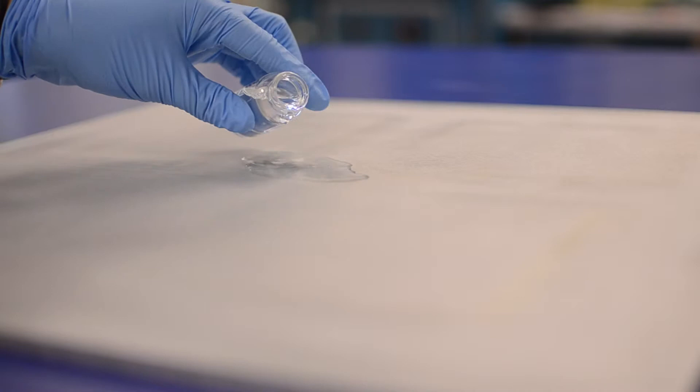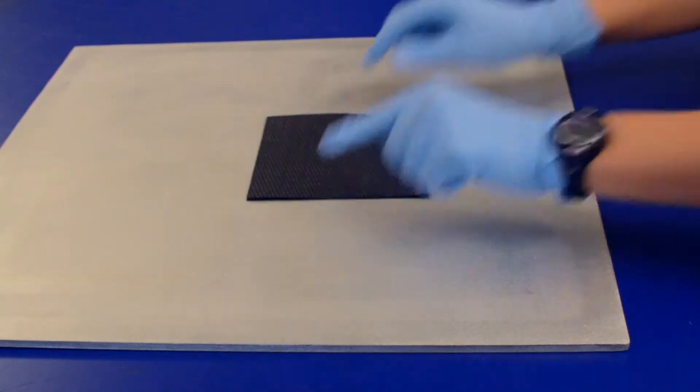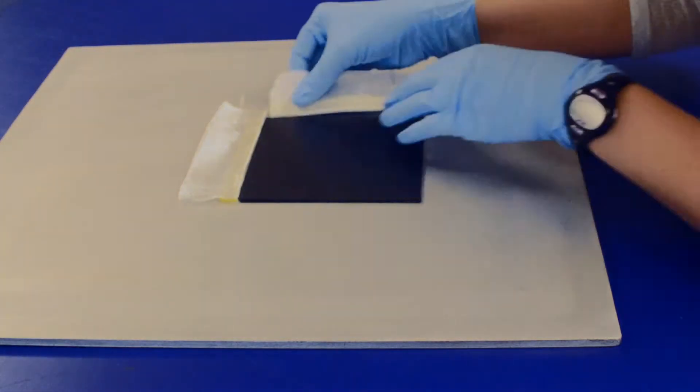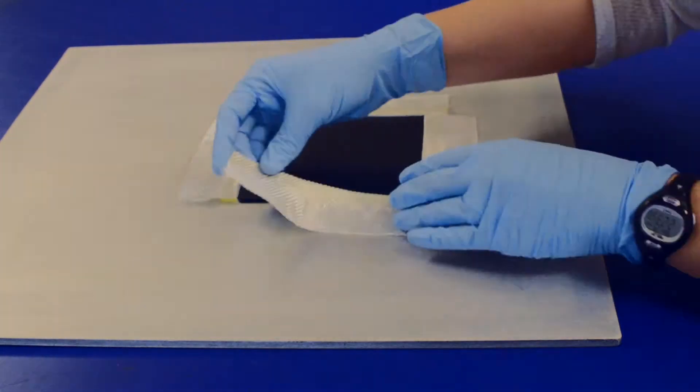First, a release agent is applied to the tool plate to prevent the composite from adhering to the tool during cure. Next, prepreg plies are stacked up and edge breather is placed around the edges to allow air evacuation during cure.